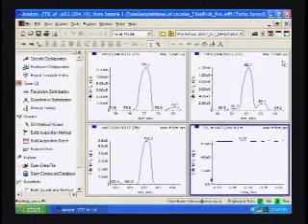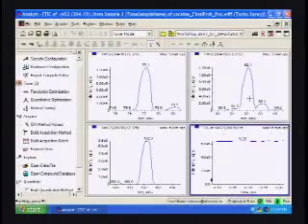So, in general, the data that we collect and we keep for our own resources includes this pane, so you can see which fragments it has selected as the best ones, and you can see the intensities.